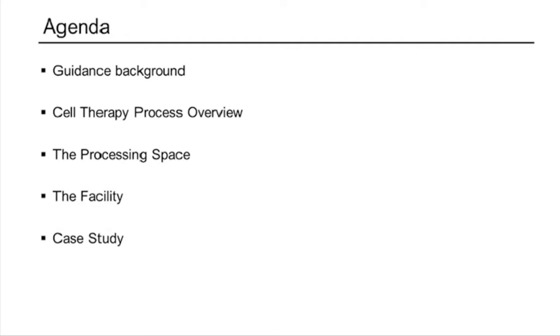The processing space, we'll talk about how those implications play a part in the design of a facility in your operating space. And then we'll do a discussion of the facility, including support functions and how the facility on the whole is impacted by cell therapy processing. And at the end, we'll talk about a case study, with cost considerations looked at as well.